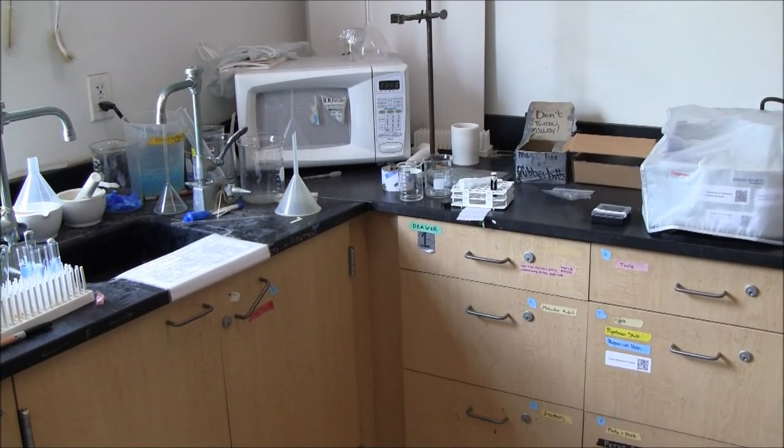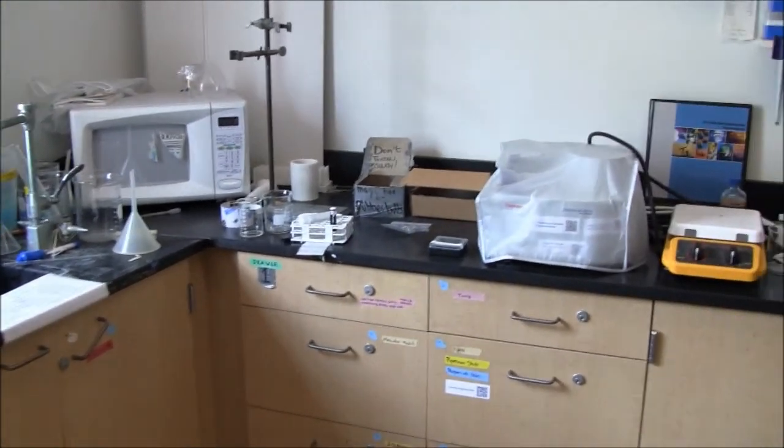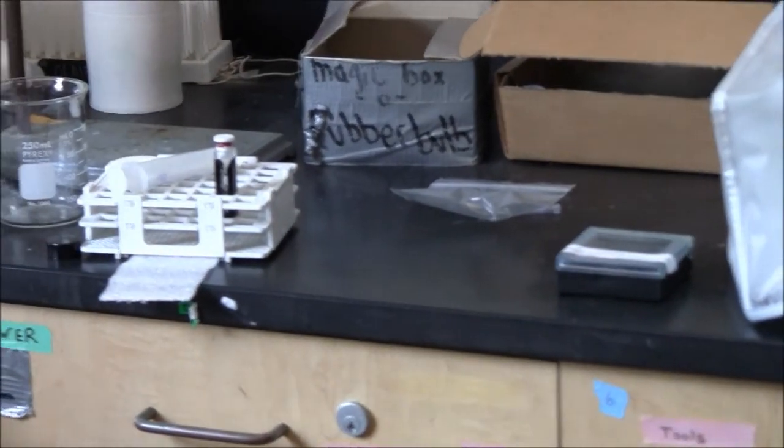Pasteur pipettes are located near the sink in the back room. There they are, next to the microwave.